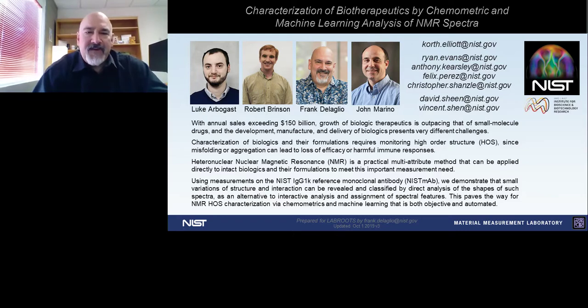Today we're going to talk about characterization of biotherapeutics by NMR and about the analytical methods and computational methods that we use to extract useful information from these spectra.